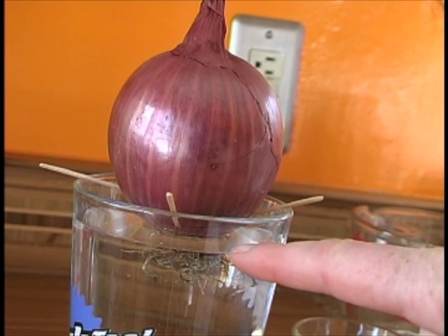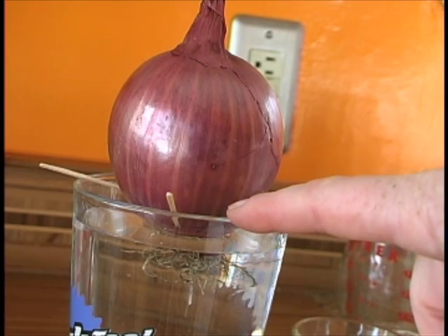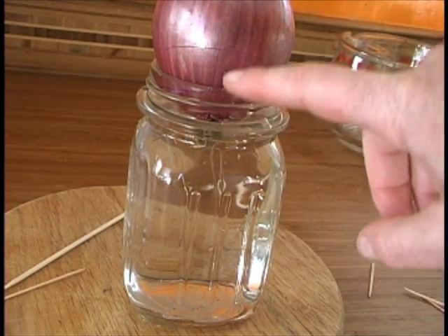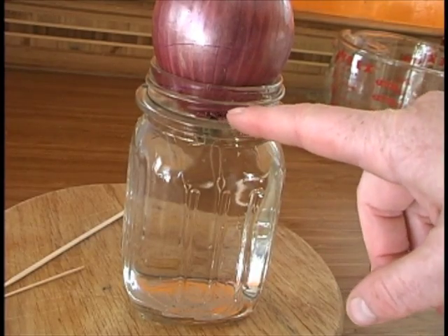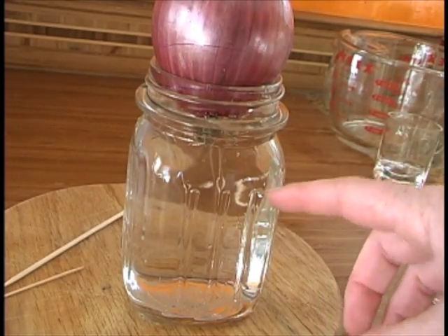To submerge the onion in water, you just want the water to come to the bottom of the onion. Here I'm using a big glass and I had to use some toothpicks. A small jar also works great — my onion is pretty large so it's not going to fall into the jar. The water is going to come up just to the bottom of the onion.